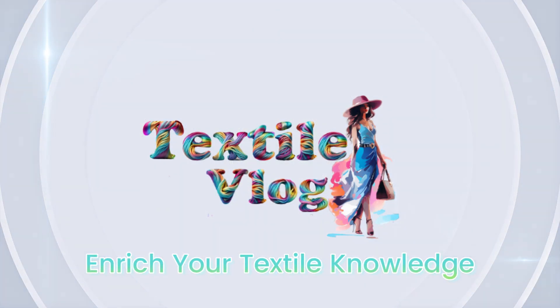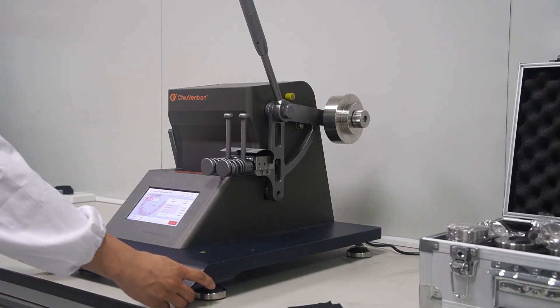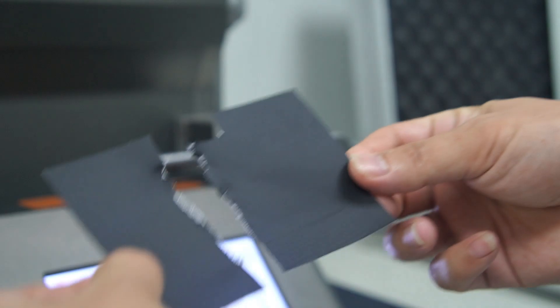Hi everyone! Today we're going to learn how to test the tearing strength of fabrics. This is an important test to see how resistant a fabric is to tearing once a tear has started.